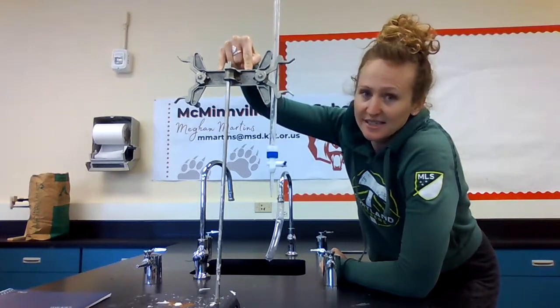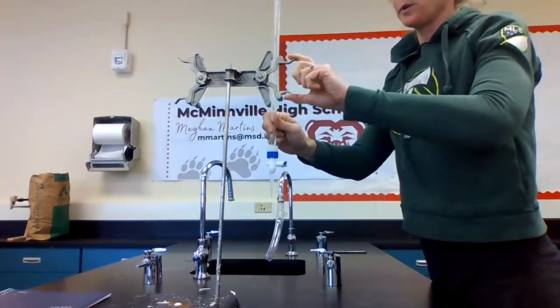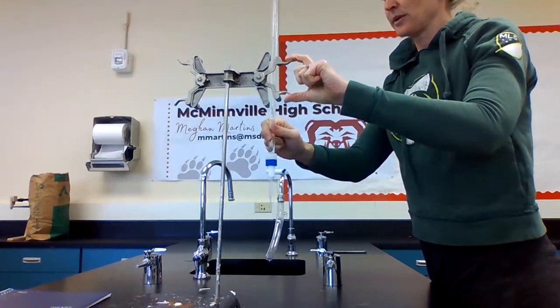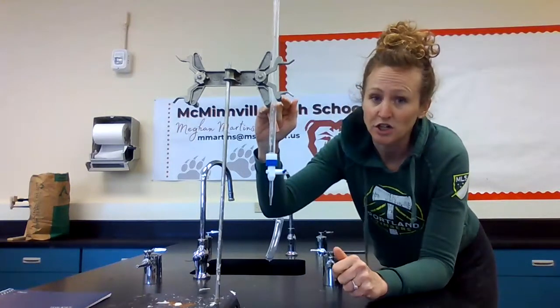Now this is piece of equipment number 3, and this is a burette clamp. Notice that it's super convenient to take the burette in and out of our burette clamp, and that's exactly what it's for. It's really secure in holding it, and it's really easy to take it in and out. It doesn't apply too much pressure like a screw would, which could crack the glass. This holds it at just the right amount of pressure so the glass doesn't crack.